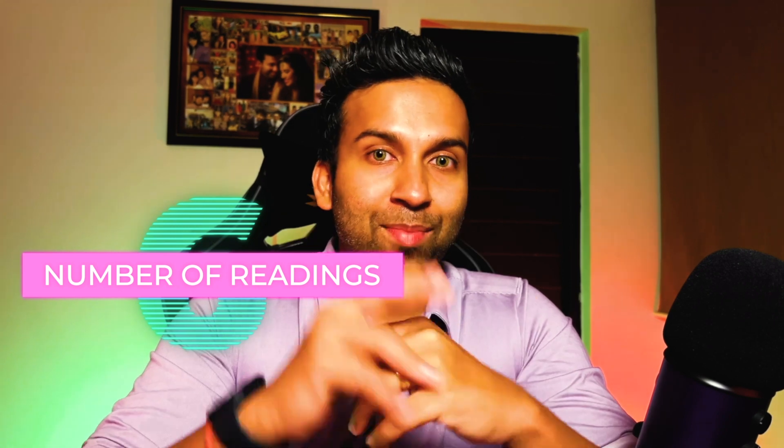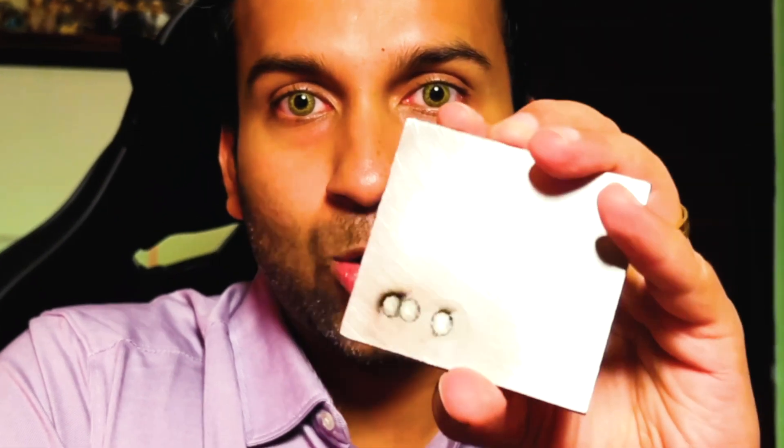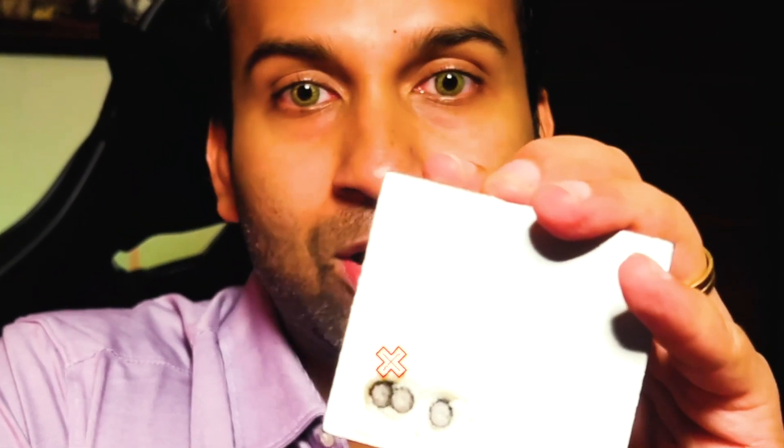Point number six: you need to take a minimum of two sparks and report the average. During the testing, we made an error — only for demonstration purposes — where two sparks overlap. This does not guarantee good results, so always ensure that each spark is distinct and at a distance from each other.